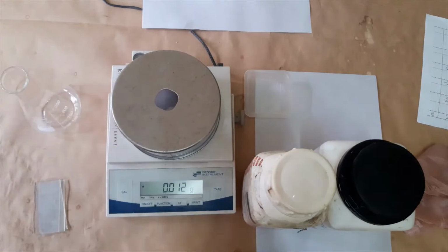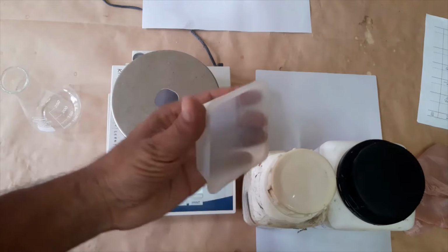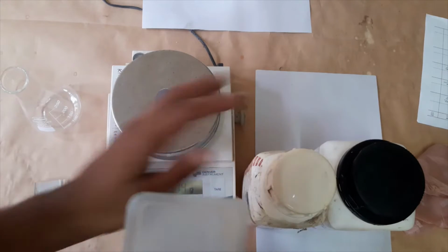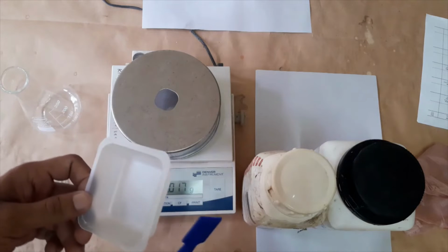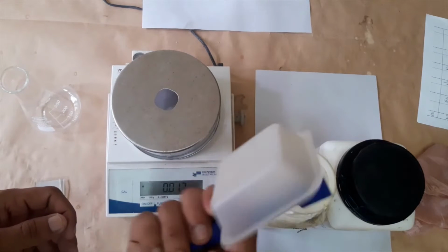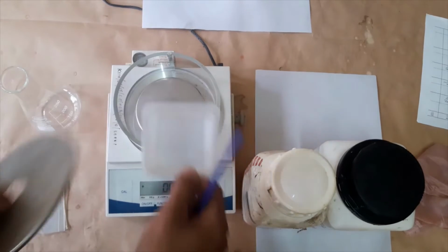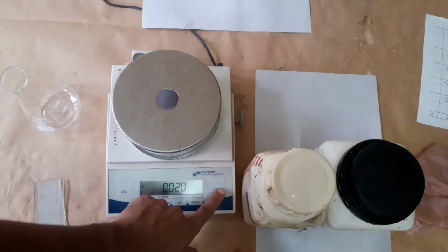First of all, we are measuring. Here I have a weighing pad. Nowadays we use weighing pads to measure this type of chemical. This pad will not corrode from the silica gel. However, usage is very limited because other chemicals will harm this material, though silica gel will not affect it. Okay, here in the balance we have to tare first.